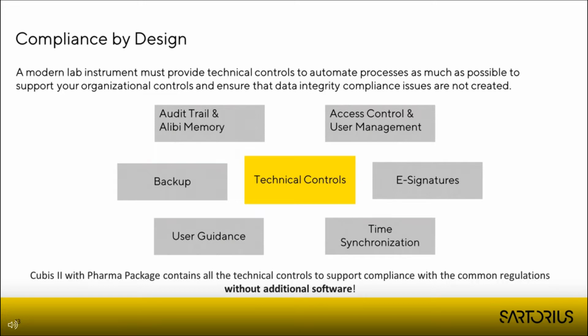Then the instrument should come with proper access control and user management, so that users always have to log in with a personal account for high traceability and have all the rights they need for their daily work.